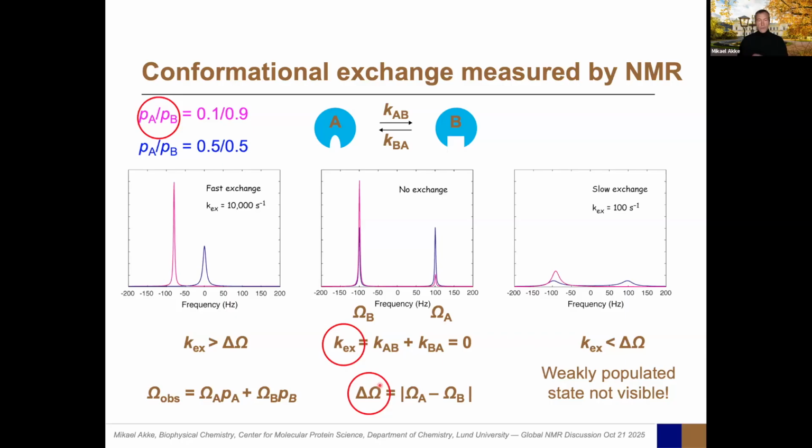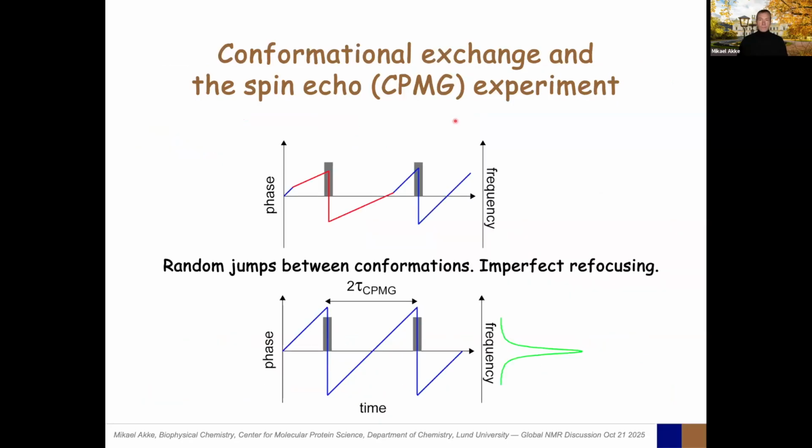But as I will show in our case, we think we can interpret them quite well. And the population, that is the thermodynamics. So we can basically define the energy landscape of this process quite well, and the structure. And there's, like I said, not much more you ever would want to know about this system.